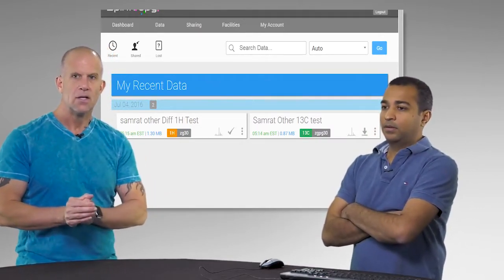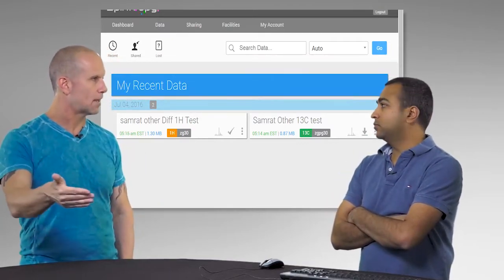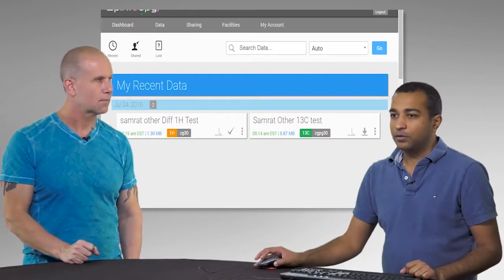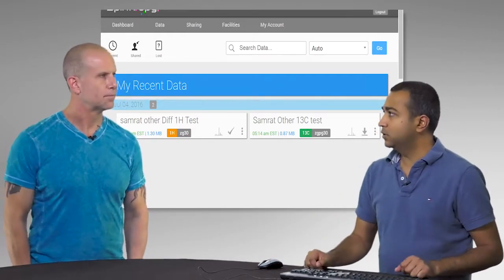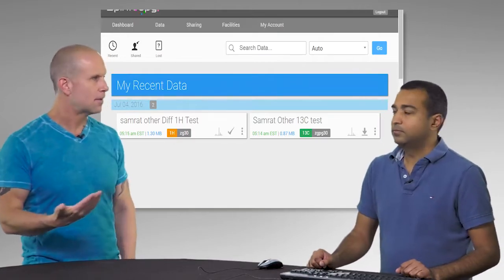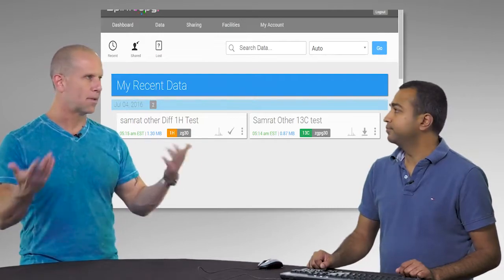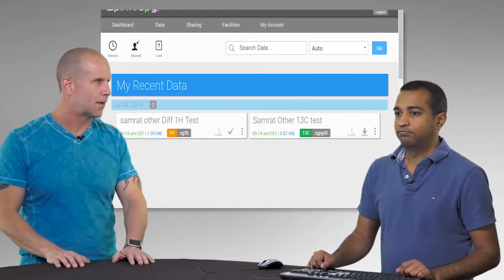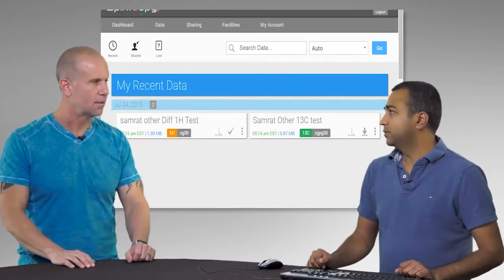Exactly. Okay. By default, you don't save it in any ASCII format of any sort? Actually, I think in that folder that you download, there's an ASCII version in there as well. So it's bundled along with the zipped folder. Then you could try to read it in standard MATLAB or SigmaPlot or Origin or a number of even spreadsheet programs that can handle large data sets. Excel even, yeah.